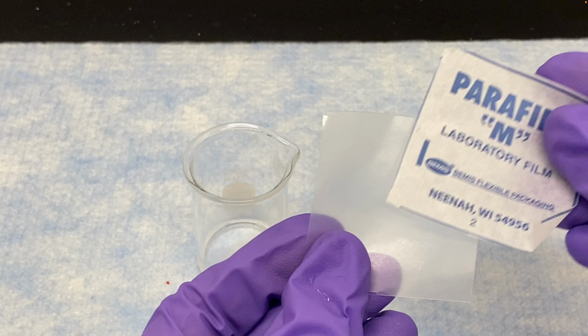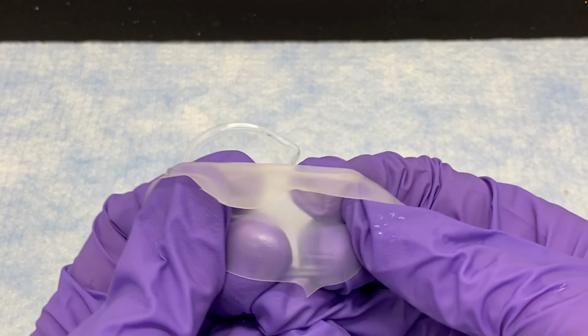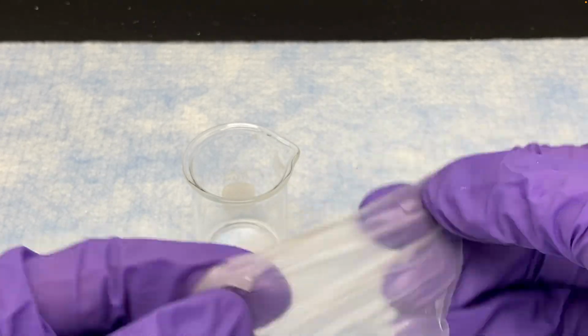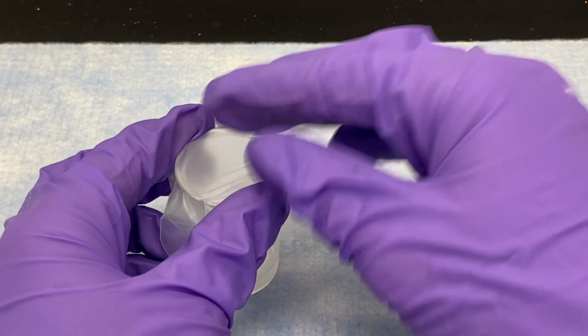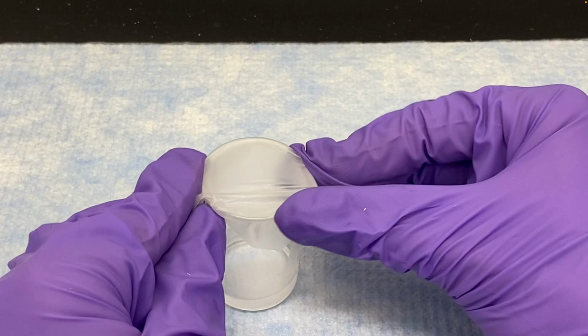The solvent, ethyl acetate, will evaporate very quickly, so you want to make sure you cover it. You don't want the solution to dry while you still have the sodium sulfate there, because then you won't be able to distinguish your solid camphor from the sodium sulfate. If that does happen to you, just add more ethyl acetate. It will dissolve the camphor, but it won't dissolve the sodium sulfate. And you'd let that sit for 10 minutes.